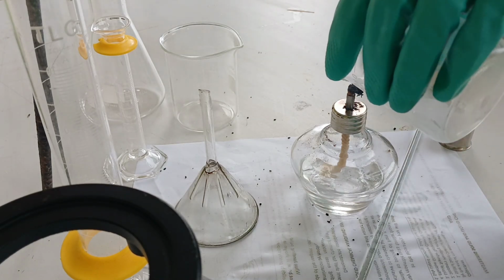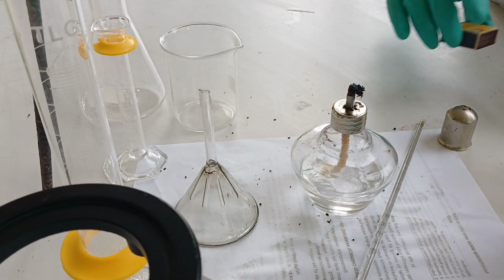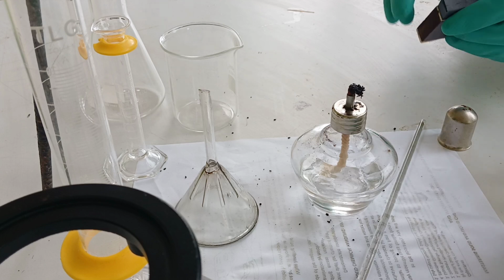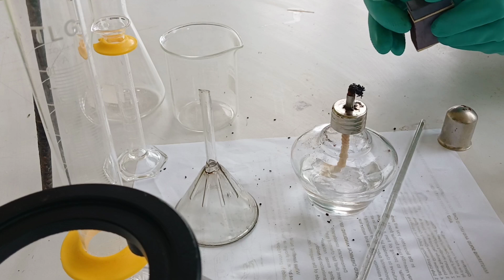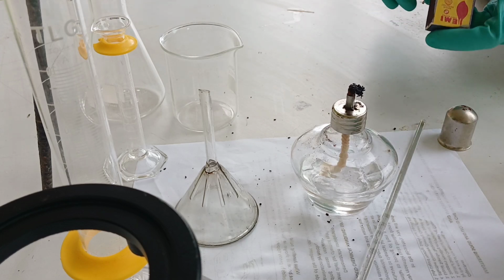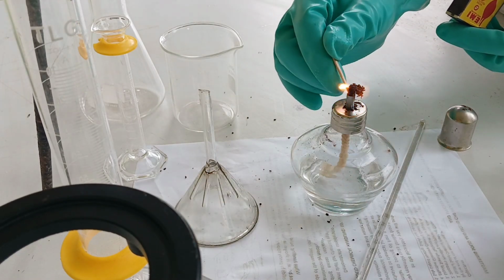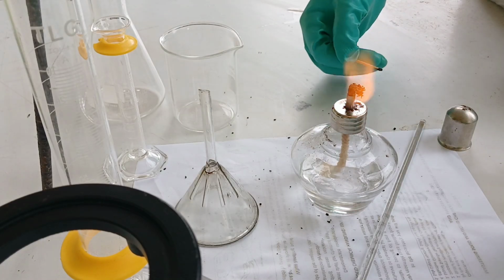Ganyan lang siya. I put a small portion, and I'm sure mo flame na siya. So let's try using the matchstick to ignite so that the lamp will create a fire. So it's created a fire.